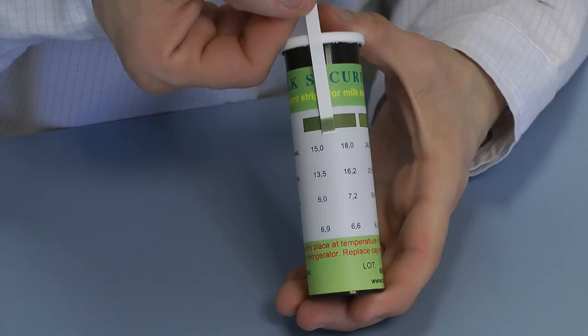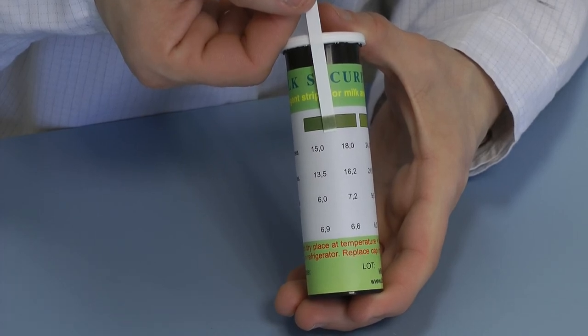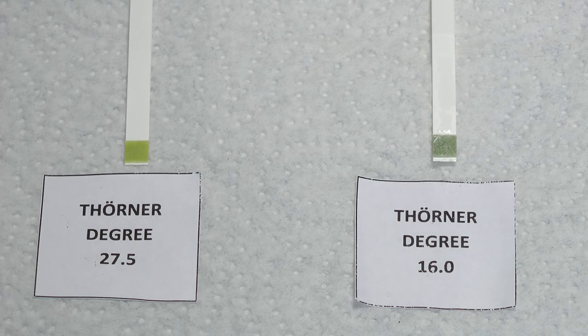The indication area is changing its color from green to dark blue-green. Milk Security Tests allow you to use high-quality milk in the dairy industry.